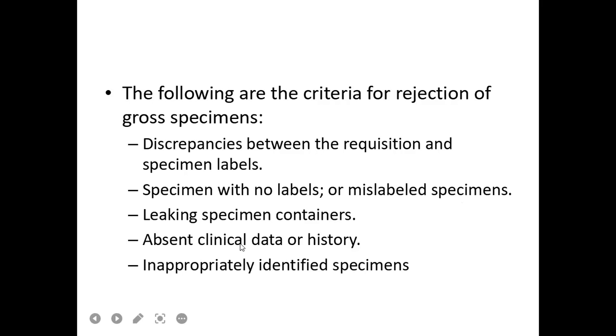Because it will be used by the pathologists, no? As a clue. Kung ano yung pwedeng disease na present sa specimen. No? So para meron siyang hint kung ano yung dapat niya hanapin. Next is inappropriately identified specimens.